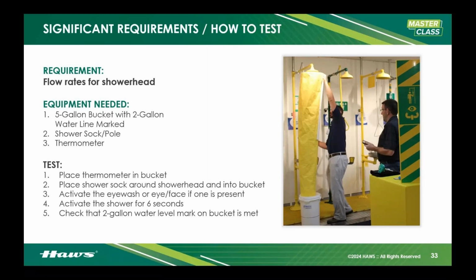Okay. Activate the eye wash first, or the eye face wash if one is present. We want to make sure that's running if there's one installed, because it's designed to work together. And we want to ensure there's no starvation at the eye wash or the eye face wash when the shower turns on. I'll explain that here in a little bit. Then activate the shower for 6 seconds and then promptly turn it off.